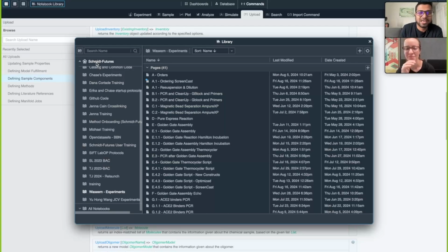So, for Emerald Cloud Lab, you basically work with this software that they provide called the Command Center. It's a tool where you access every single aspect of their cloud lab. As a first step, in order to perform any experiment for your DNA pipeline, you would first need to order the DNA samples and reagents. Once you have those in the physical lab, then you can use them to perform experiments. So today we are going to take a look at how to actually do that using the Command Center software that they provide us with.